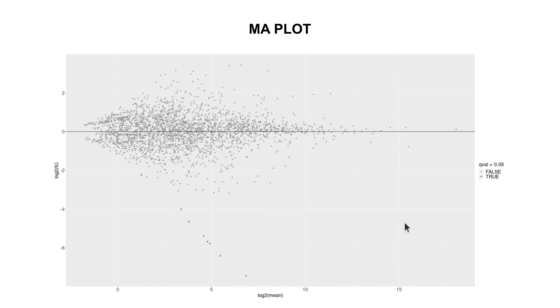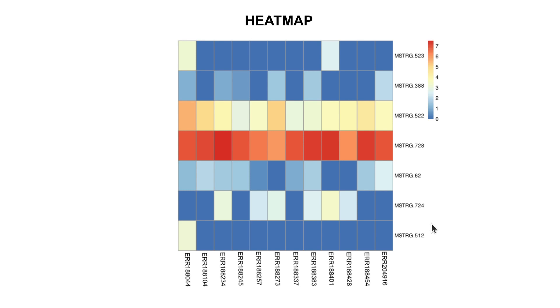Now let's look at the last plot: heat maps. Heat maps are a great way to visualize and interpret gene expression data using a color code. This heat map was generated using differentially expressed genes, showing their expression levels across 12 samples. Low expression genes appear in one color region, and high expression genes in another. For example, the gene MSTR green dot 728 is expressed at high levels across all samples.